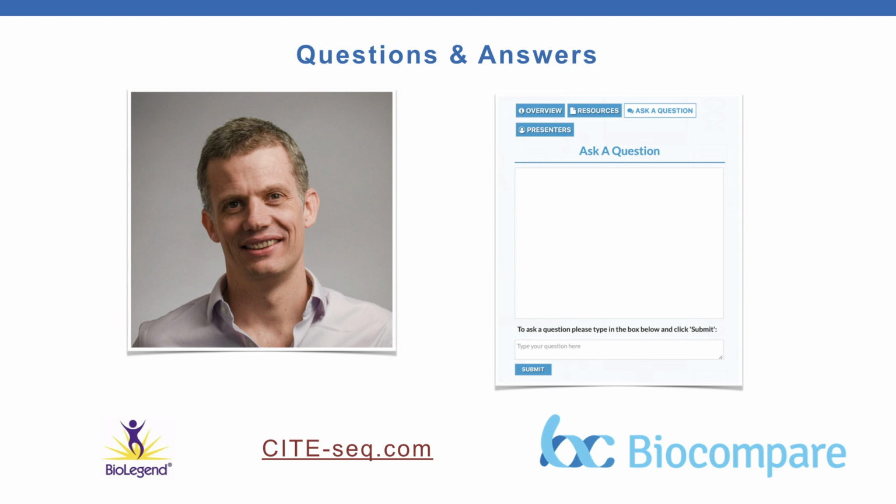Okay, here's one of the new questions that came in. What is the standard procedure to test the best condition of CITE-seq for new antibodies? For a new antibody, that's a good question. We haven't done a huge amount of work with new antibodies. Most of the time, we're working with antibodies that have been very well characterized by flow cytometry or by CyTOF for many years and are pretty much well accepted.